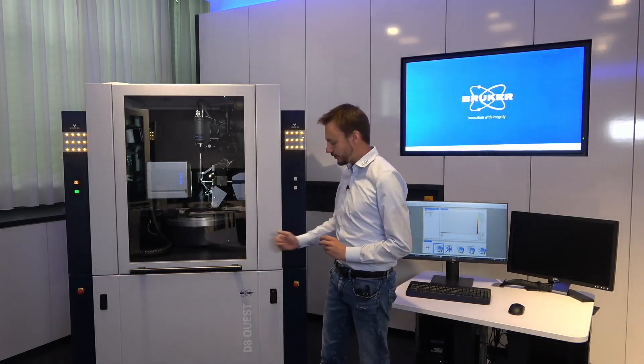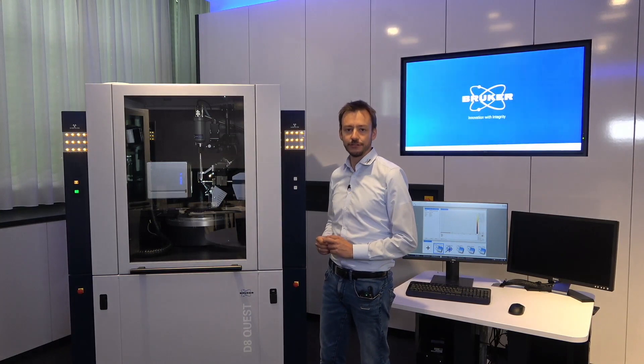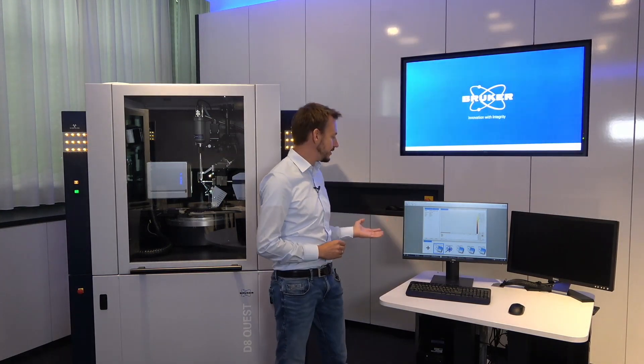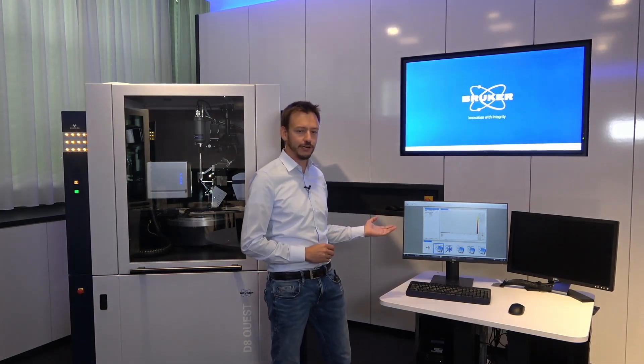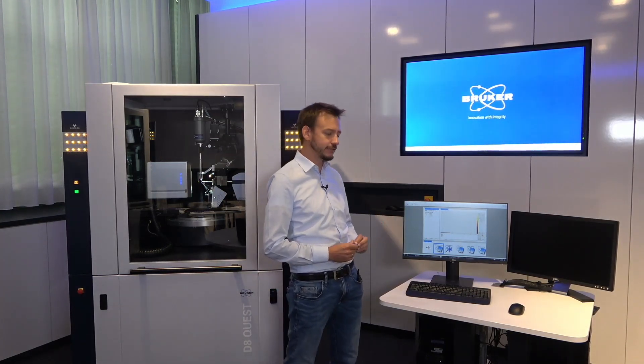All you need for this is our D8 Quest diffractometer, a control PC with our automated Structure Now software, and of course a crystalline sample.